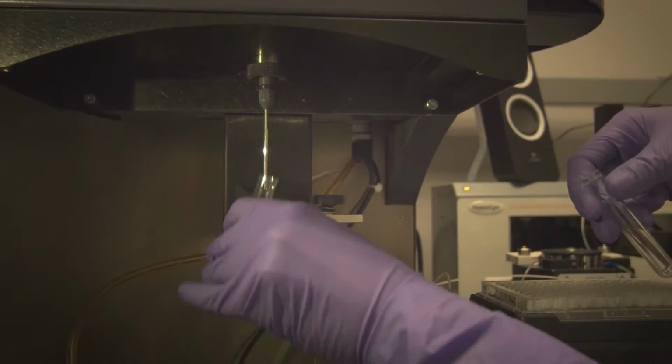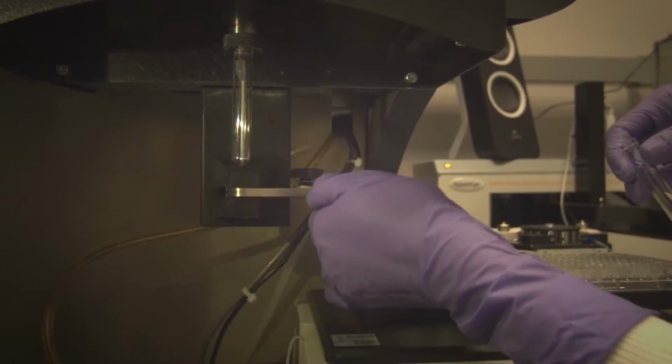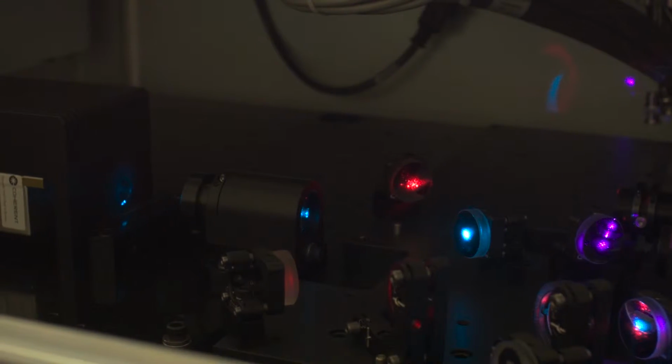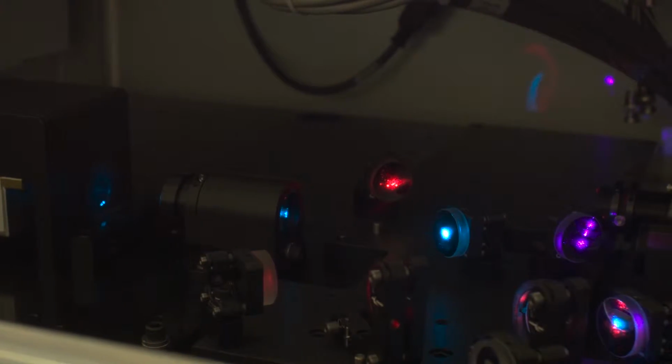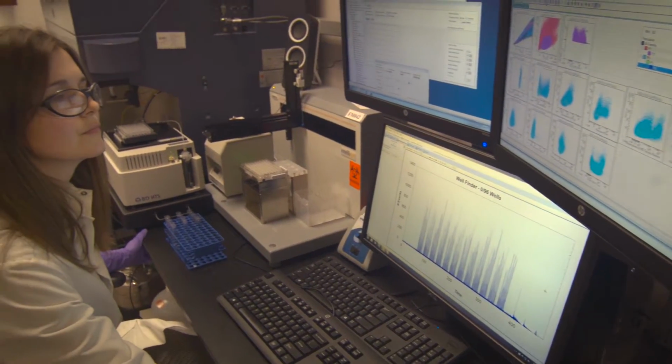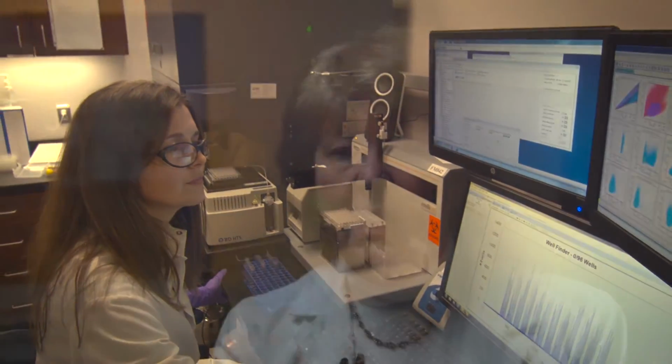You hear often about chemotherapeutic drugs that really wipe out the bone marrow. You kill the cancer but kill the patient. Well, this allows us to fine-tune those aspects. We can look at what is happening not only at our target, but with everything surrounding that target.